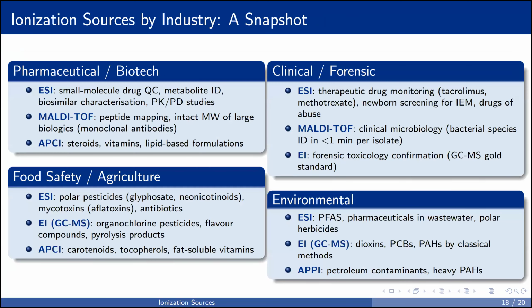Industry applications. Here's a quick tour of how the different sources map onto the industries. In pharmaceutical and biotech, ESI is the workhorse. Small molecule drug QC, metabolite ID for drug development, and so on. All ESI. MALDI-TOF is a specialist for intact biopharmaceuticals. And APCI has a niche for steroids, vitamins, and lipid-based formulations.